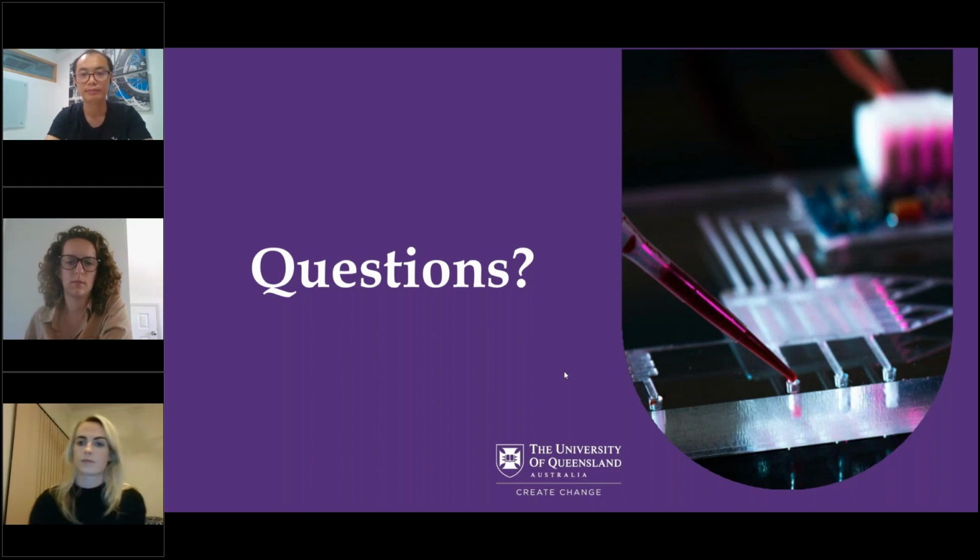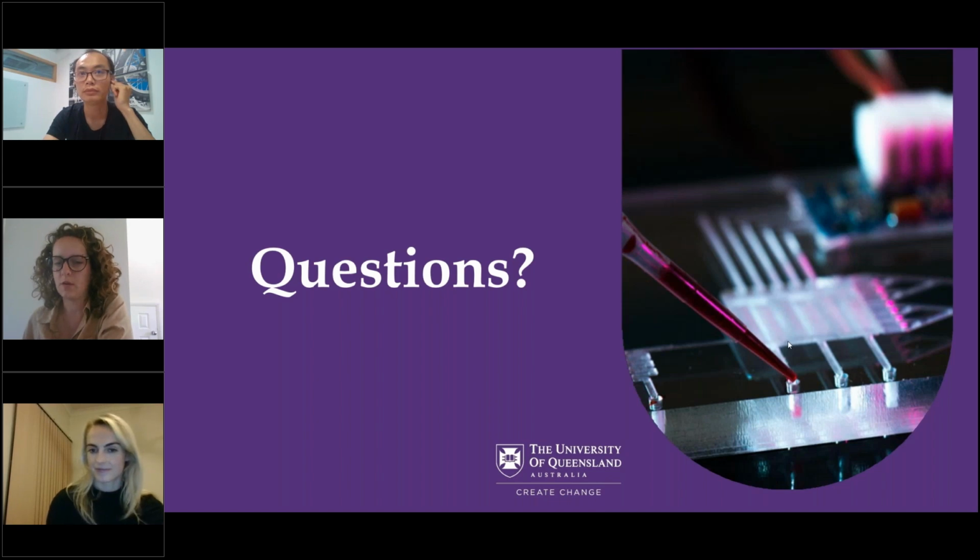Okay, great. And then one last question for Anna, just before we finish up today's session. Could you talk about the viscosity of the polymeric solutions that you use to encapsulate the particles, and whether you could potentially go to a higher viscosity than what you currently use?